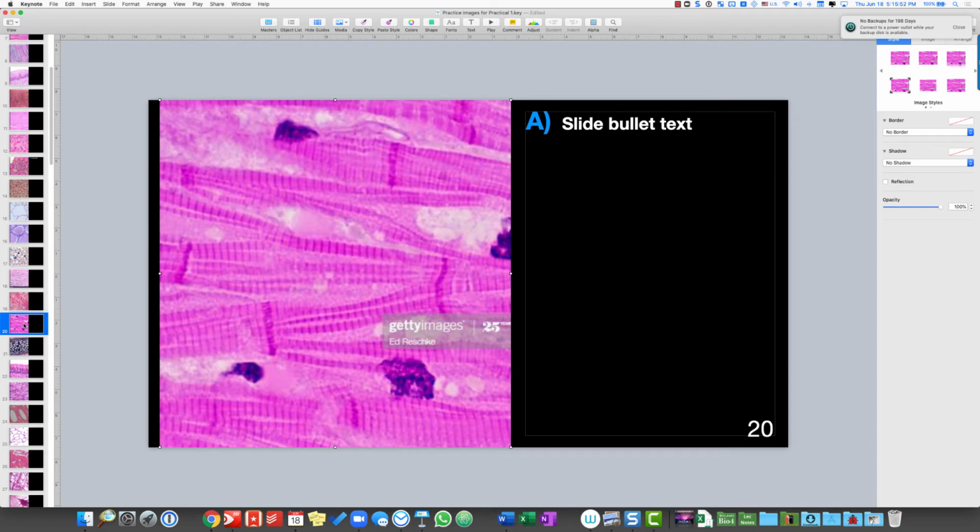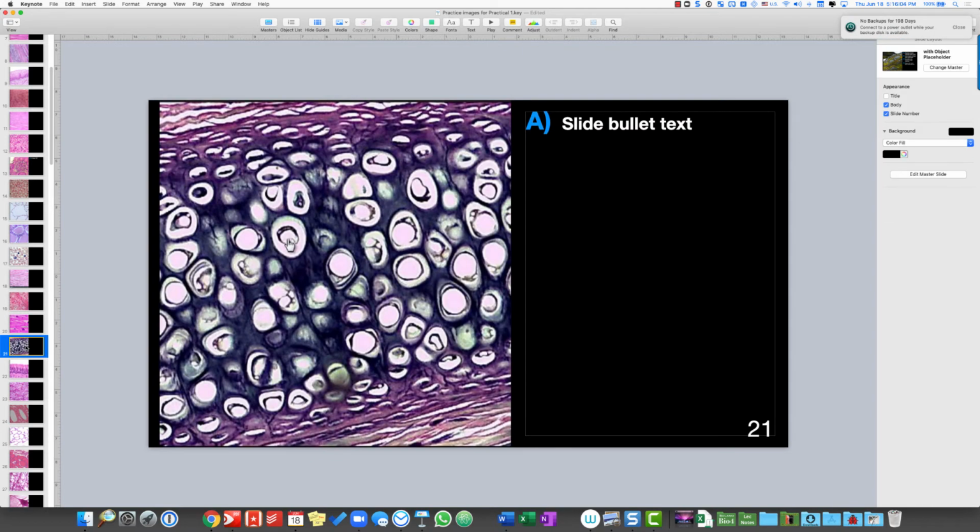So uninucleated is the term. Uninucleated means having 1 nucleus per cell. Binucleated means that cell has 2 nuclei.